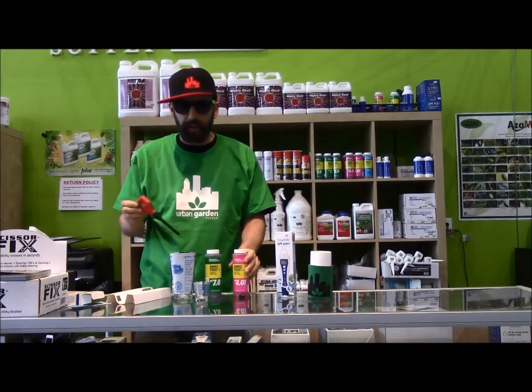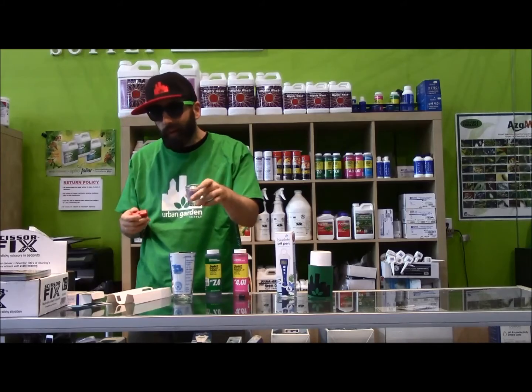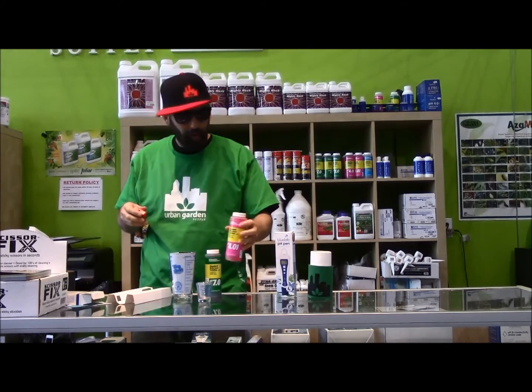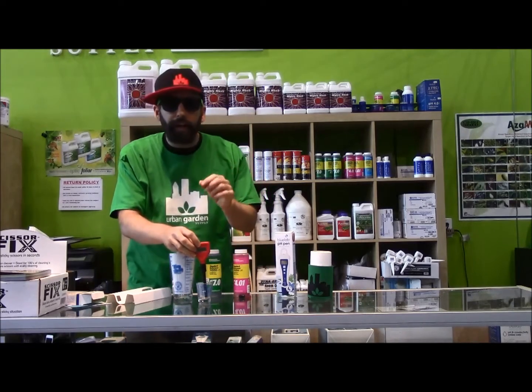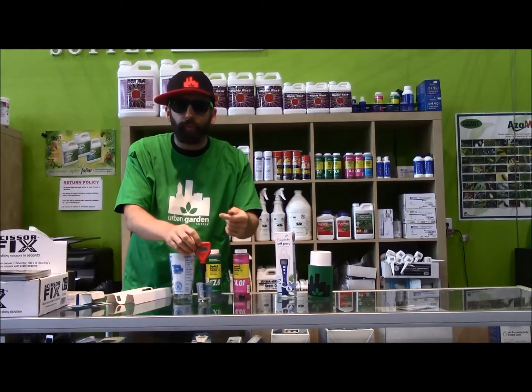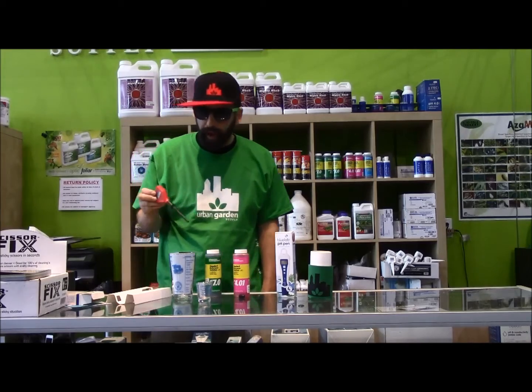For further accuracy, shake this guy off, dump this guy out, rinse it out, wipe it out. Go ahead and fill it up with your pH 4. Drop this guy in here. Again, take your screwdriver out and spin it until the screen reads 4, and whoop-de-woo, you have just calibrated your pen.